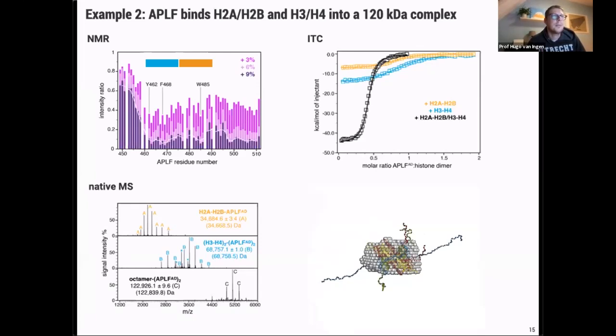But of course, here the problem is, what is the structure of one of our subunits, the APLF? This is an intrinsically disordered protein for which we certainly do not know what structure it will adopt in the bound state. So here we instead used this integrative model to come up with a good design of constructs to try for crystallography that would exclude all the floppy bits and really focus on the interaction.